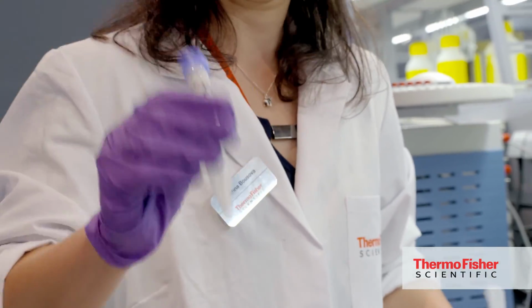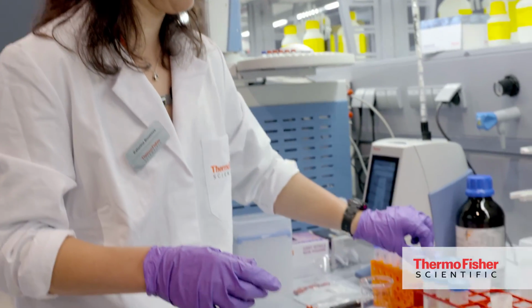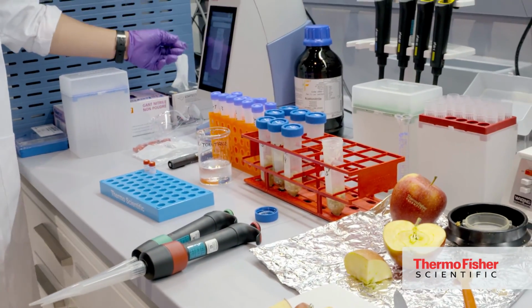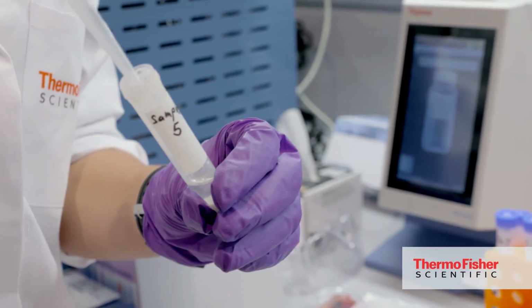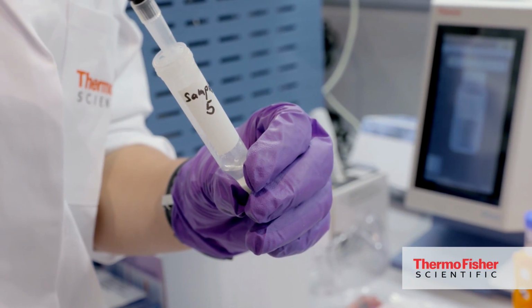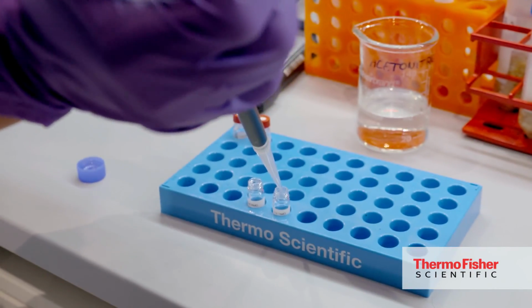Normally it is done with a shaker. After shaking time, about 1 minute, it can be put in the centrifuge. It can be centrifuged down. That again, the two phases will be separated. So the ready samples will be transferred into the vials, and the samples are ready for injection.